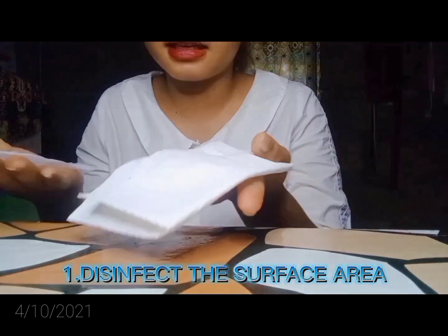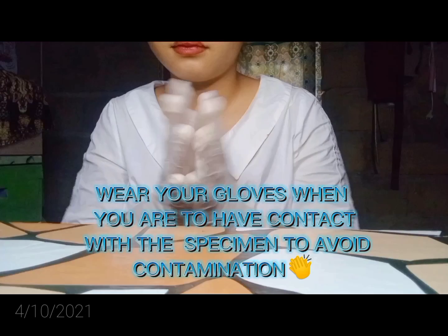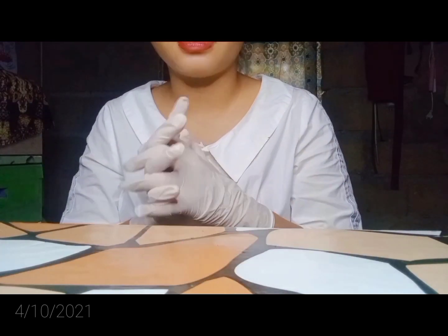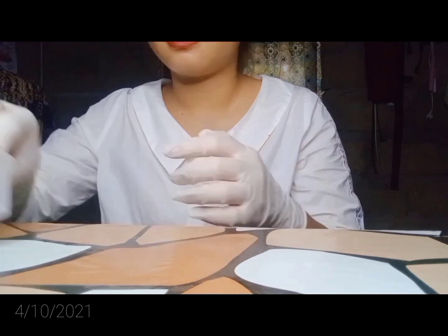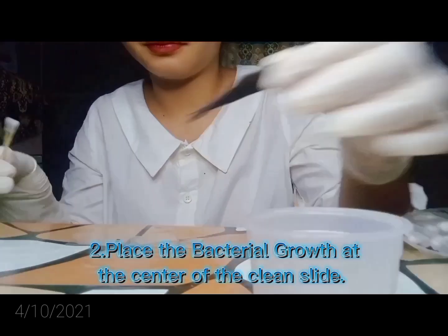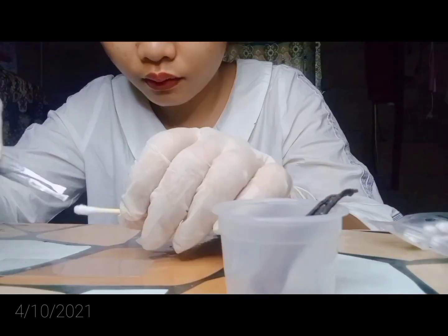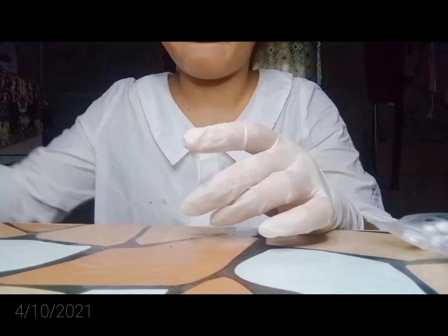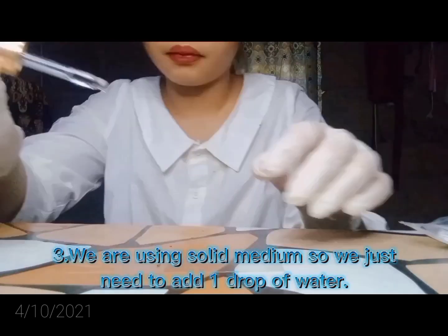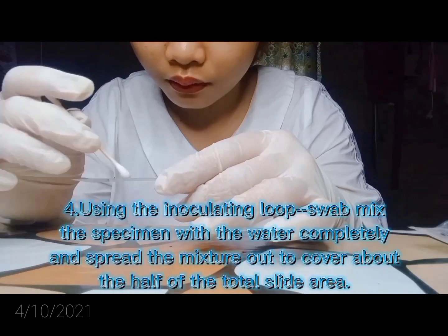So listen carefully. We need to disinfect the surface area by using these wipes and a tissue. Note that the wipes I use are alcohol based. We wear our gloves. Next, we will need our materials. Second is to place the bacterial growth at the center of the clean slide. Third, we are using solid medium, so we just need to add 1 drop of water. If we are to use liquid medium, adding water is not necessary.